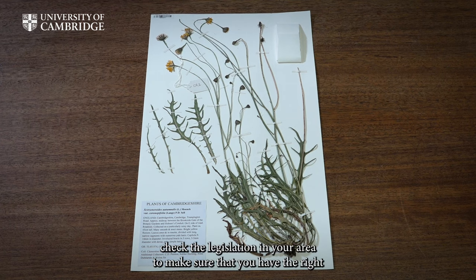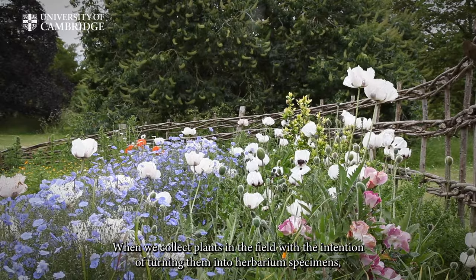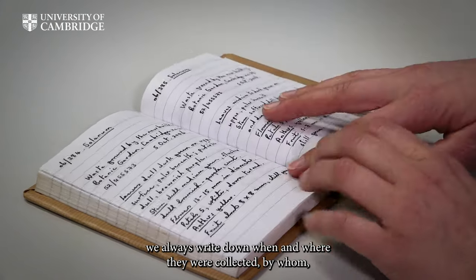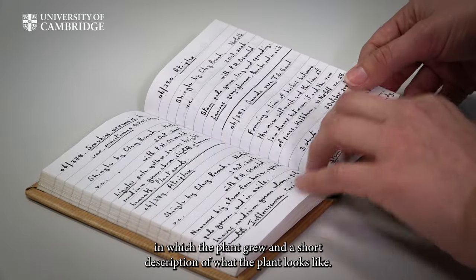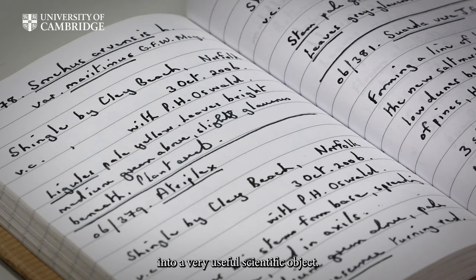Before collecting any plants, check the legislation in your area to make sure that you have the right permissions and are not breaking any laws. When we collect plants in the field with the intention of turning them into herbarium specimens, we always write down when and where they were collected, by whom, and we give them a unique collection number. We also write observations about the type of habitat in which the plant grew and a short description of what the plant looks like. This collection information is what turns a pressed plant into a very useful scientific object.